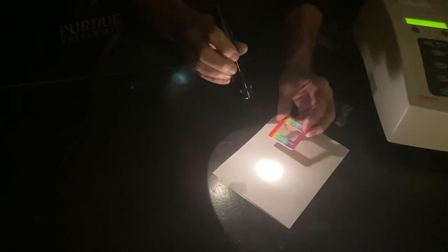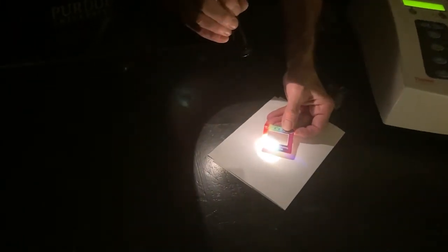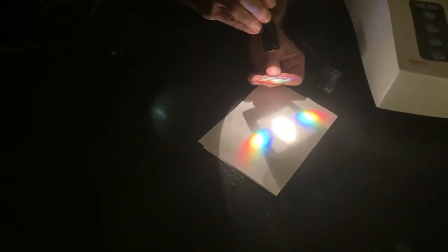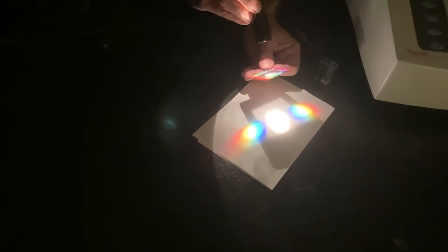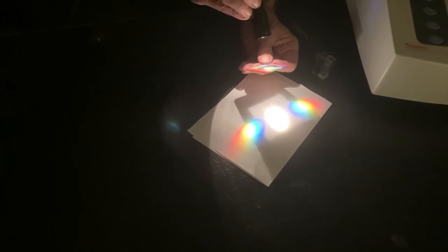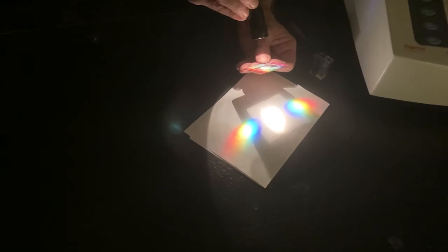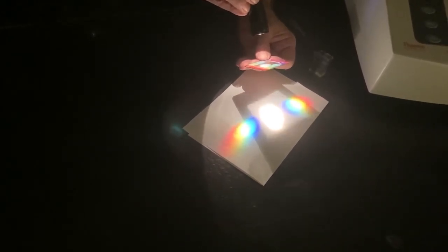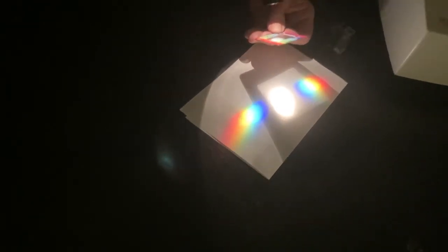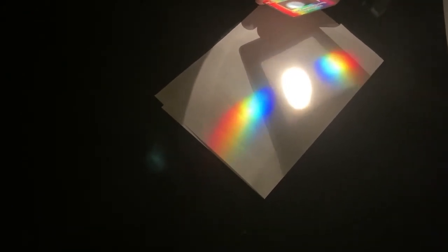So, we have a device here. You're very, very good, Bill. You have a device here called a diffraction grating, and it works just like a prism. Let me show you. Using finely grooved lines. So, there's a small detail. This is a piece of plastic that has lines, a thousand lines per millimeter etched into it. And it does the same function as a prism. It disperses the wavelengths of light into their separate colors or separate frequencies.